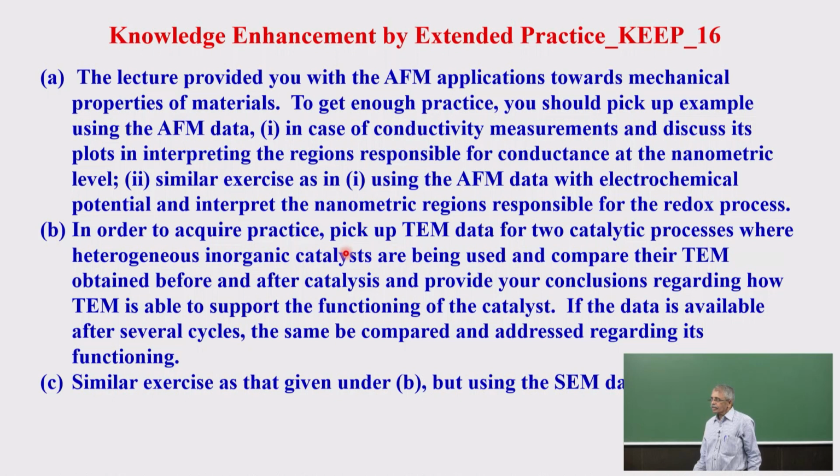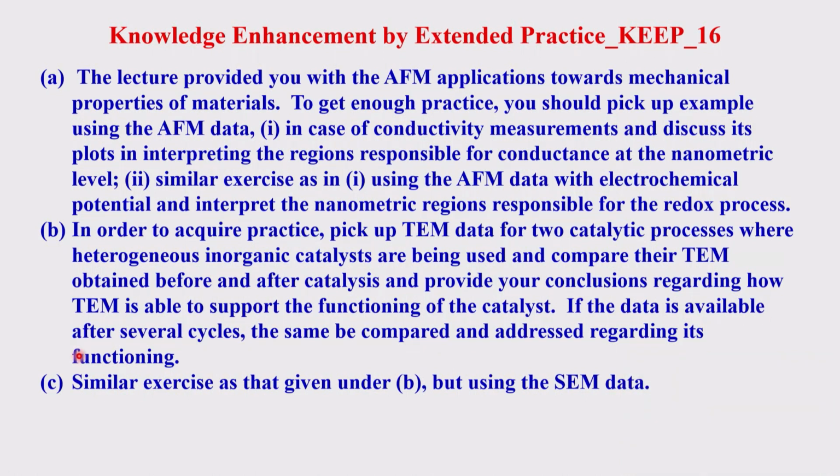In order to acquire practice, pick up TEM data for two catalytic processes where heterogeneous inorganic catalysts are being used, and compare their TEM images obtained before the catalysis and after the catalysis, and provide your conclusions regarding how TEM is able to support the functioning of the catalyst. So this is very important, and you can do it for a few cases. If the data is available after several cycles, then a similar comparison can be made and addressed regarding the functioning of the catalyst.